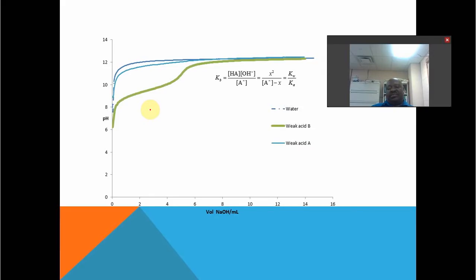All right, so let's look at some standard ones here and get the impression of things. So here is a case where we're titrating a really weak acid, really on the weaker side. What happens then? Well, being a weak acid, the initial pH is higher and higher on this scale here, and so it turns out if you're titrating with the same base, you'll end up in this region for all of them.